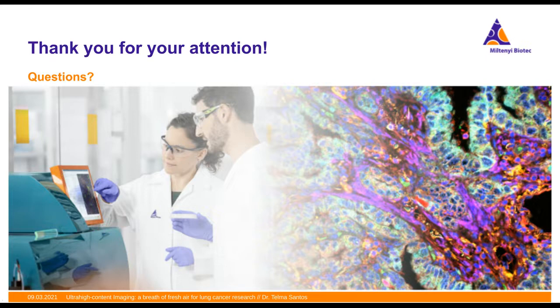Next question. Are the antibodies used in a stain directly conjugated? Is amplification used? And are those antibodies proprietary or common clones? So the antibodies we used are primarily conjugated antibodies.